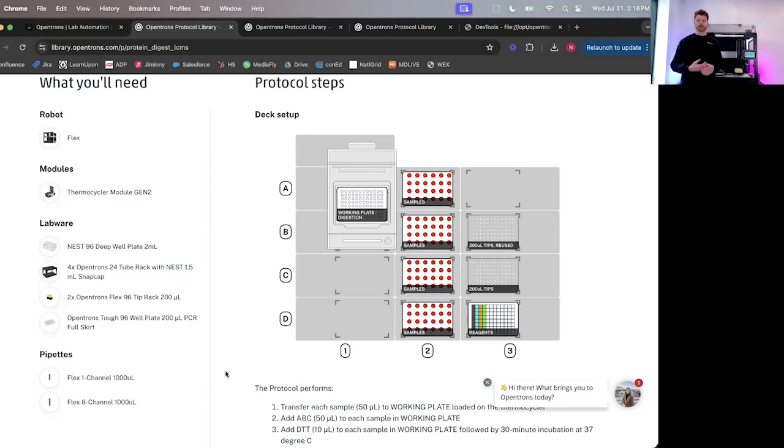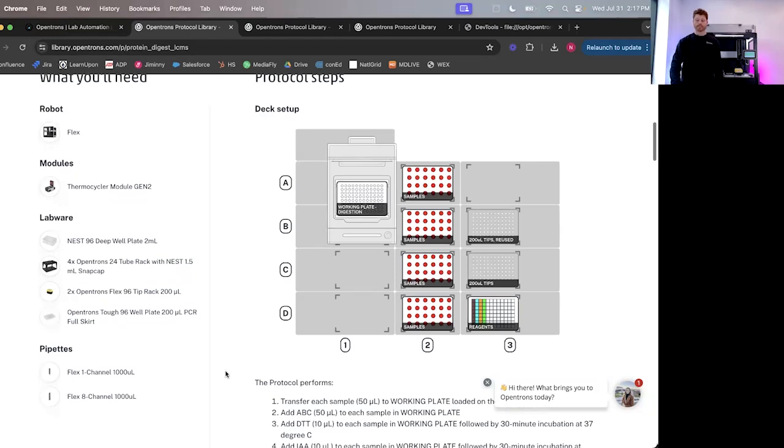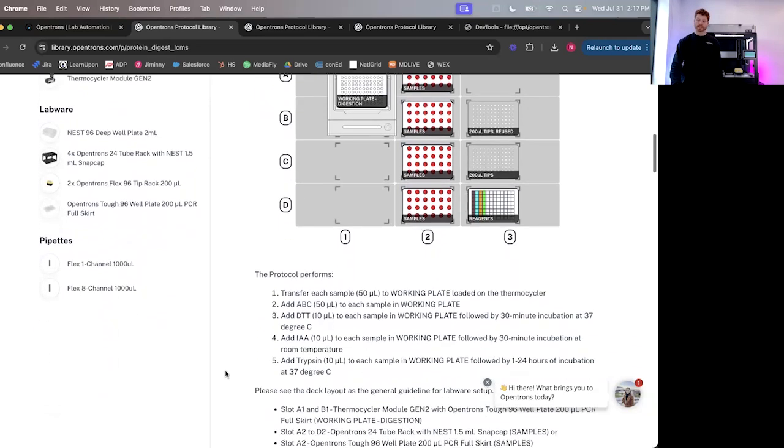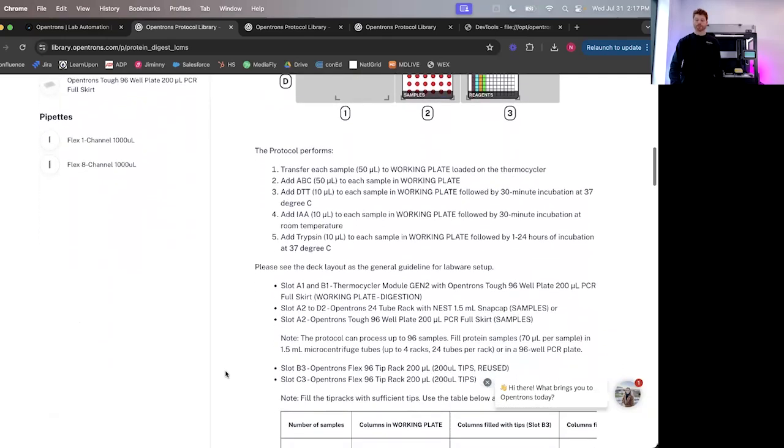We do also have another product offering in terms of a protocol amendment, in which our FAS team will also come either on-site or remotely and modify a protocol that is already in existence. But hopefully the protocol library is going to get you very close to being able to get up and running immediately.